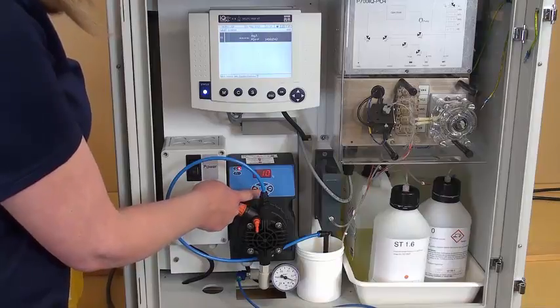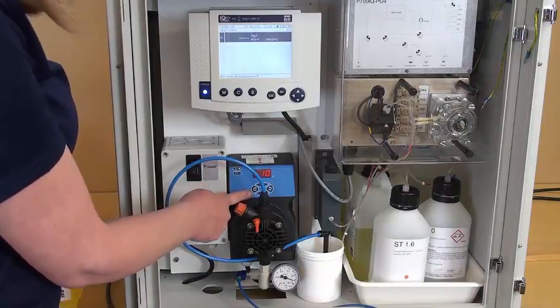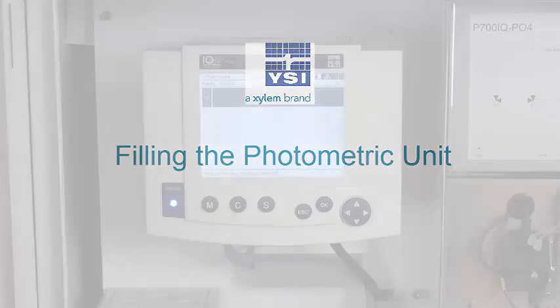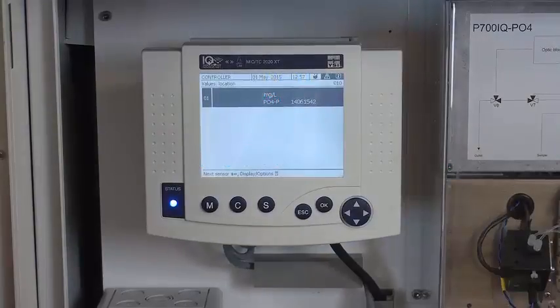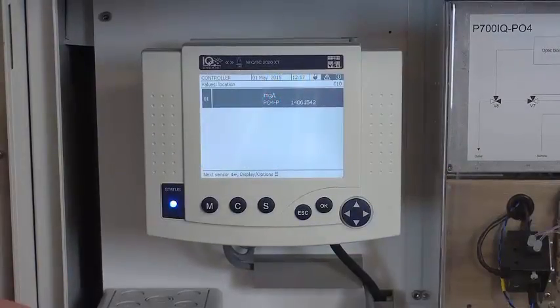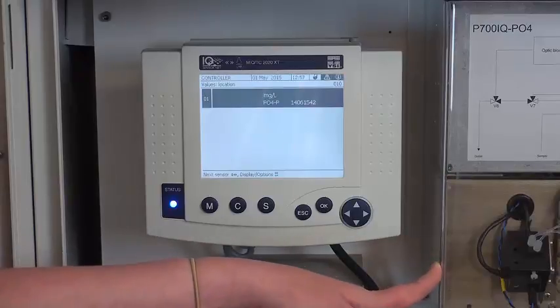And then you can restart your pump. The pump is primed and delivering sample to the overflow vessel. I'm ready to fill the photometric unit.